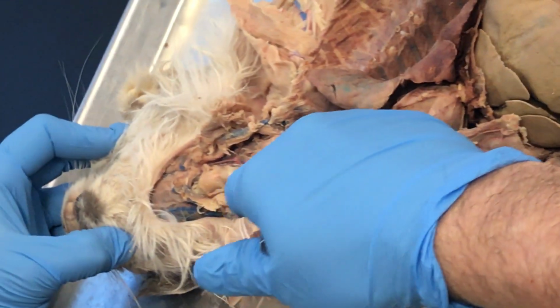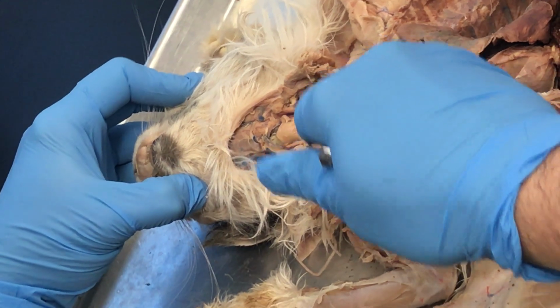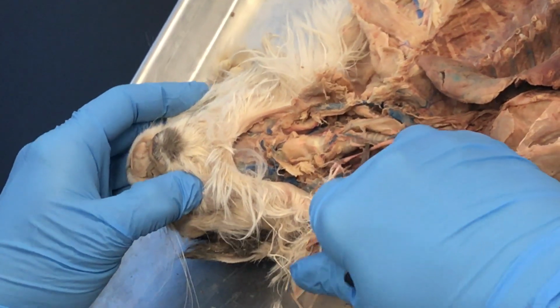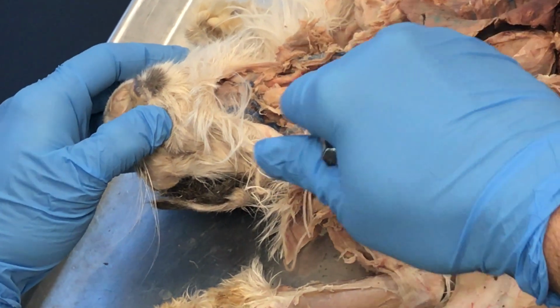The esophagus is actually this structure. You can kind of see it here on the side. That's the esophagus here. The trachea is here. The esophagus should sit behind, but in this case it's kind of on the side. That's the esophagus. Let's see what else we have.